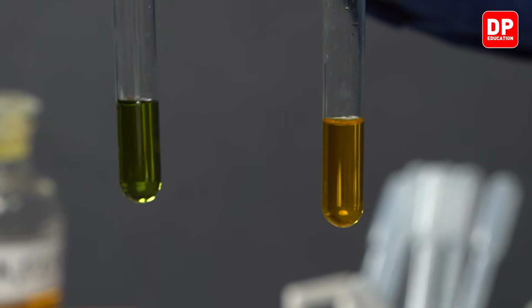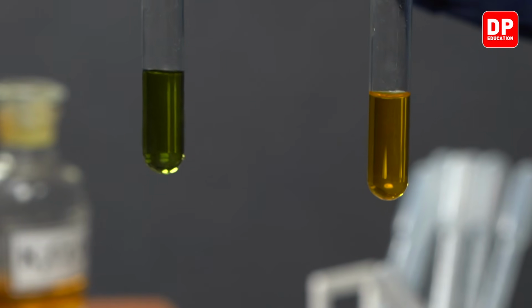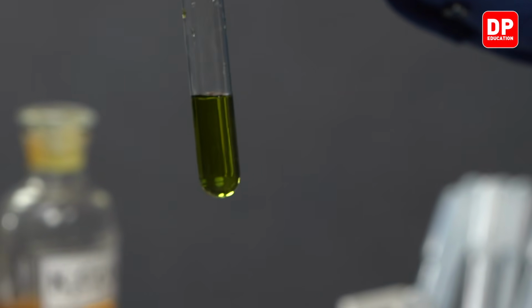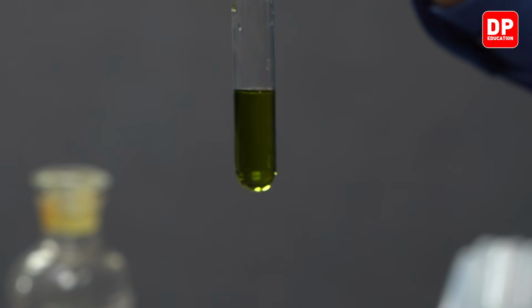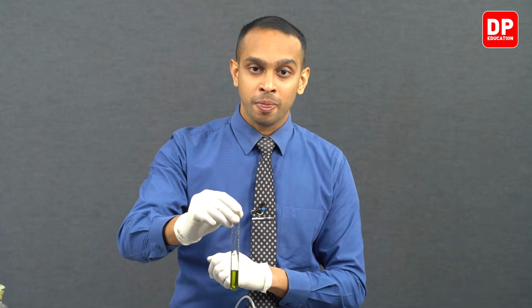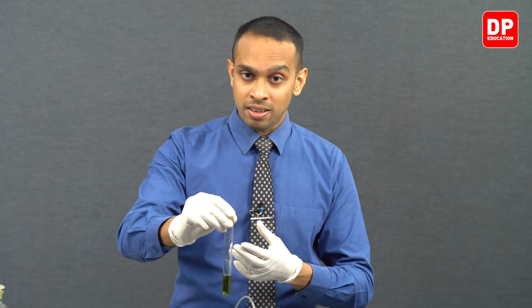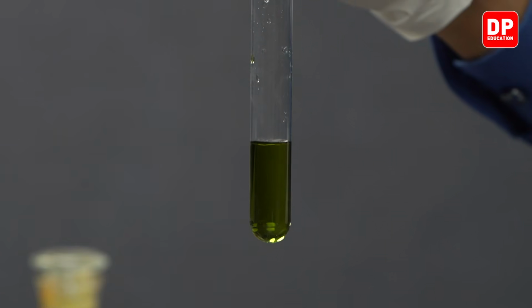or the dichromate ion got reduced into chromium 3 plus, and chromium 3 plus ions in aqueous medium will form a complex with sulfate ions and water, which is green in color. That is why we observe this green color solution here. And as dichromate got reduced, the sulfur dioxide got oxidized to form sulfate ions. Sulfur dioxide got oxidized to form sulfate, and dichromate reduced to form chromium 3 plus ions, and that is why we observe this green color solution.